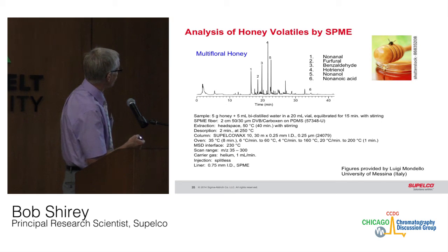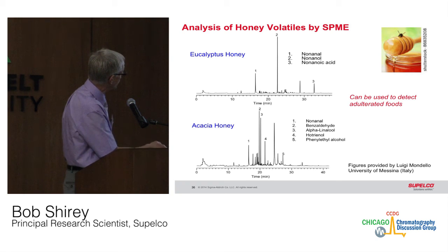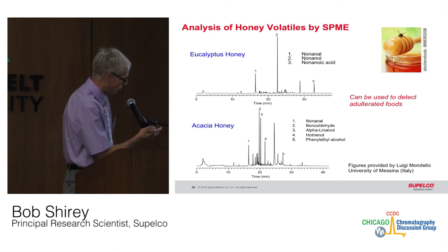The analysis of honey, we're just showing this to show how nicely it picks up these volatiles out of a syrupy type of matrix. And this one shows a difference between the different types of flowers, primarily C9 components compared to acacia honey. So it's a good way to tell if a label claimed it was 100% acacia and you saw a lot of these components in there, then you realize it probably isn't.